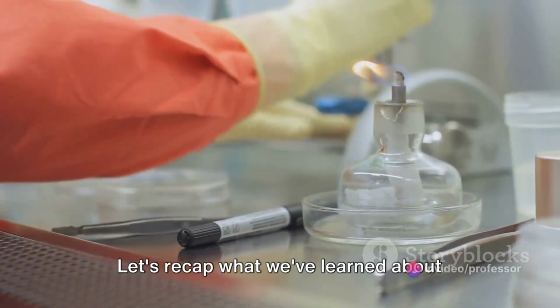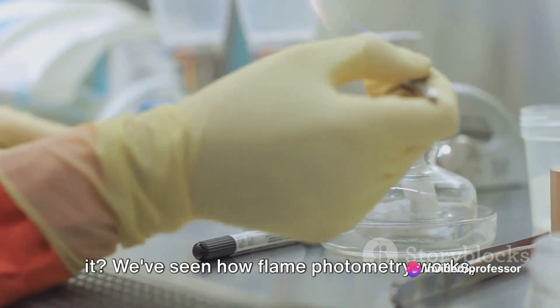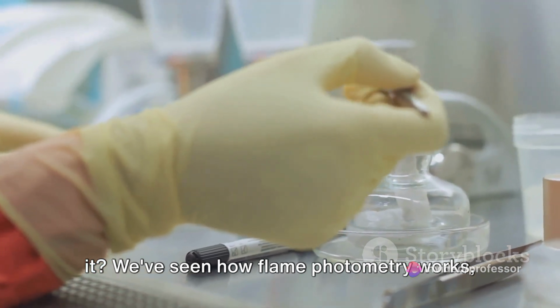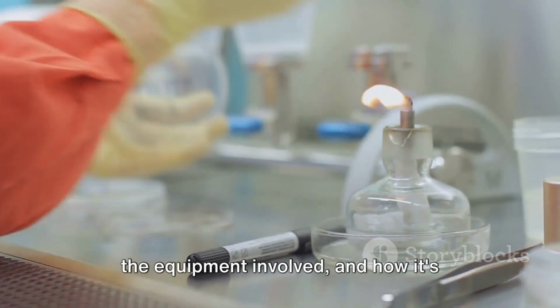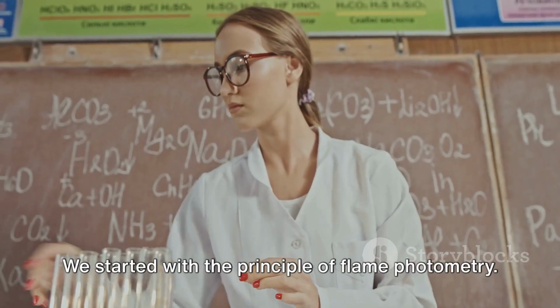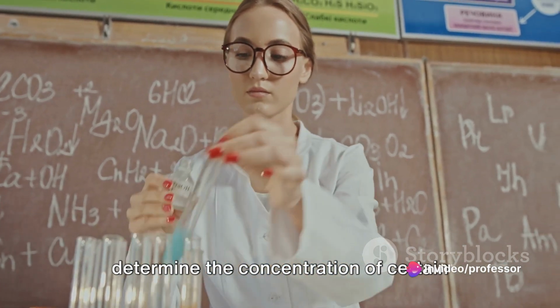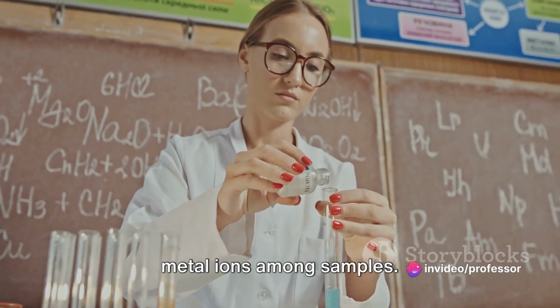Let's recap what we've learned about flame photometry. It's been an enlightening journey, hasn't it? We've seen how flame photometry works, the equipment involved, and how it's applied in various fields. We started with the principle of flame photometry. We discovered that it's a method used to determine the concentration of certain metal ions among samples.